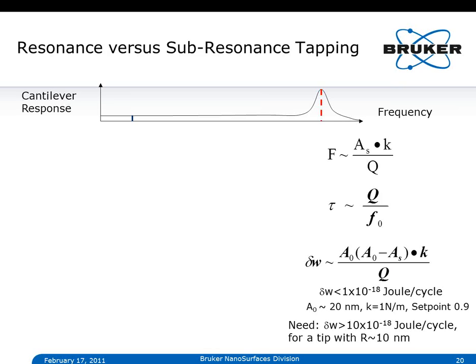So you need a little bit more energy, and that of course is the limit here in what kind of force resolution we can achieve with our specific system in tapping mode. Is there a solution for it? Of course there is one, otherwise I wouldn't show you that slide here.